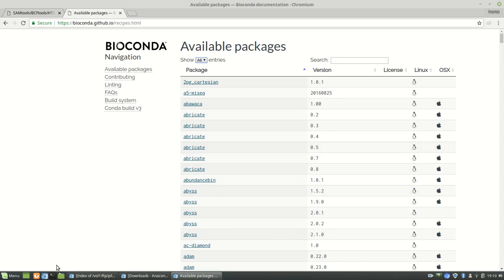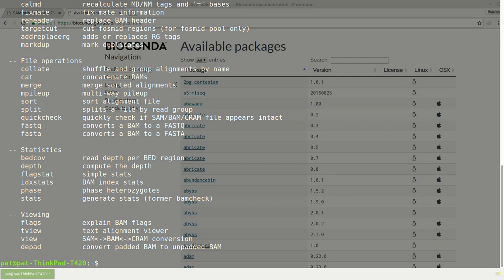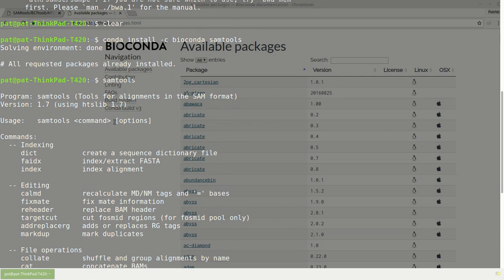Let's check on our thing. So, it's already installed. Great. If I wanted to use SamTools, I just type in SamTools here, and here I get all the different options. And I can just start running SamTools. Easy as that.